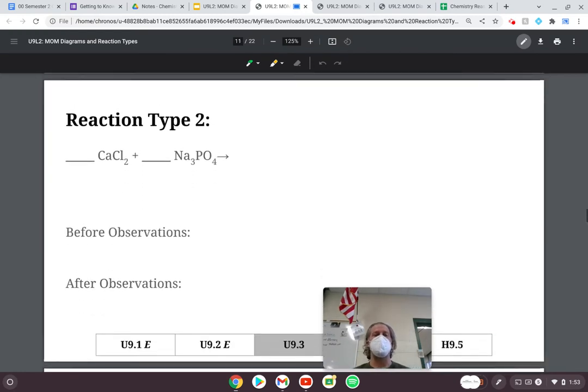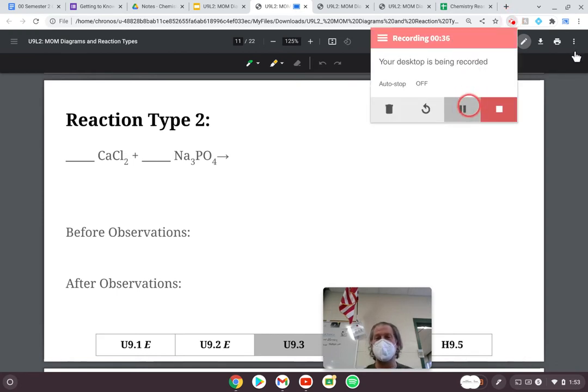Today, we are going to talk more specifically about something called reaction type 2, which we'll talk about what that is in a minute. So I'm going to go grab the materials I need for that. I will be right back.